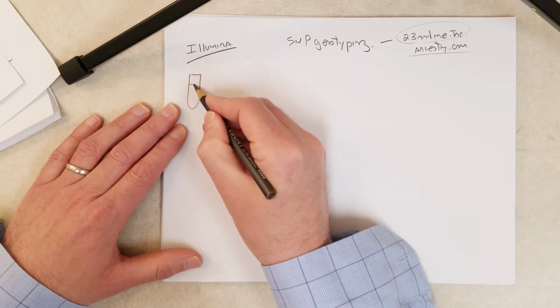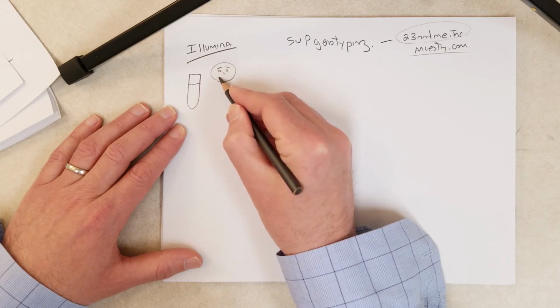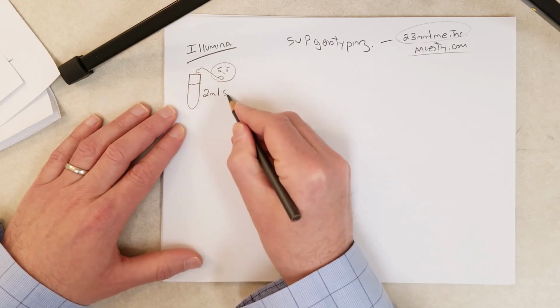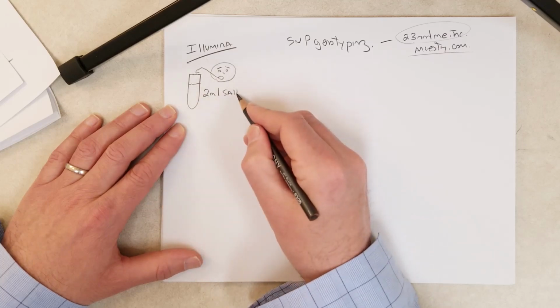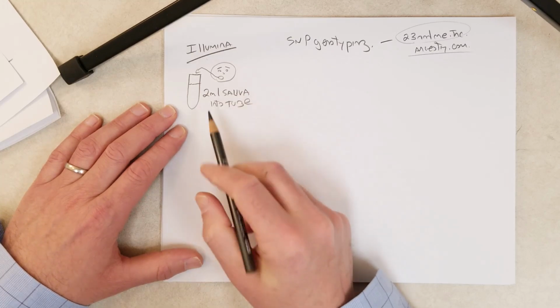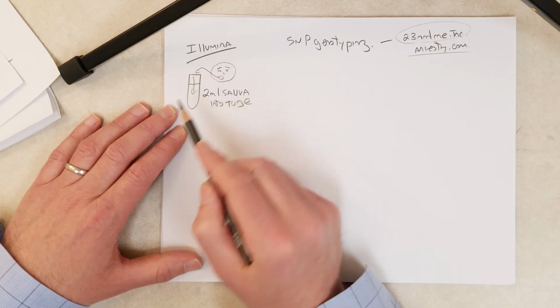So essentially, let's talk about how this process works. Let's say this is an individual, just a person, John Doe. John Doe here will spit into a tube, enough that he puts 2 milliliters of saliva into the tube. Then he will cap the tube, and the cap contains, I think, an ethanol solution or something that stabilizes the saliva.